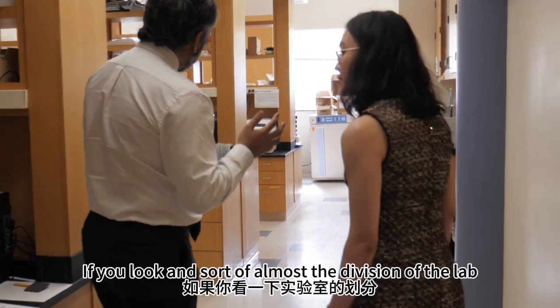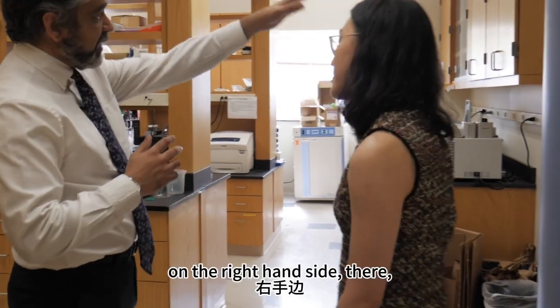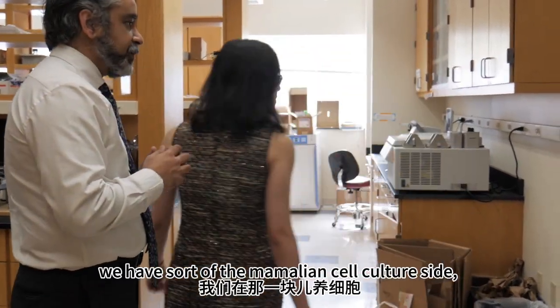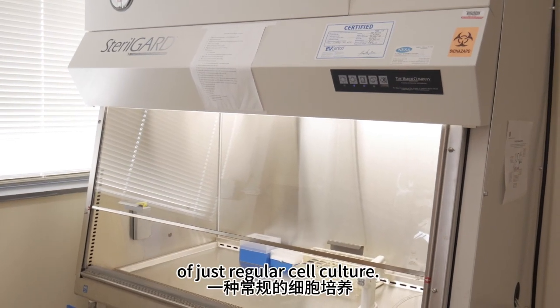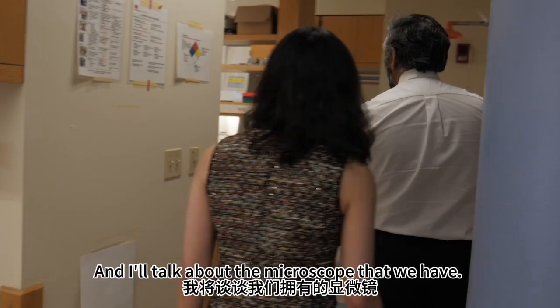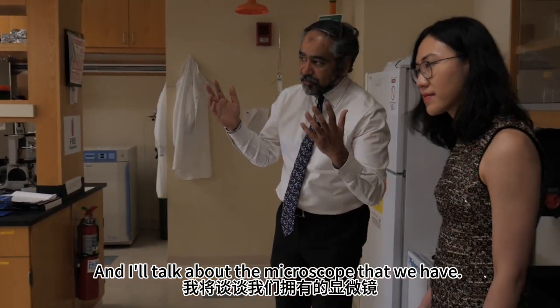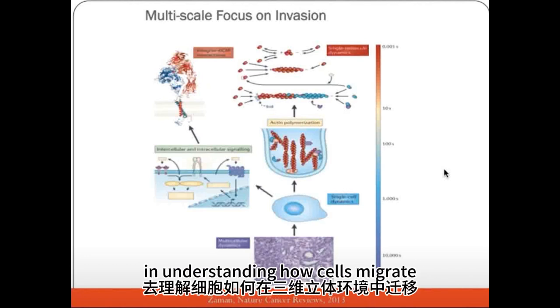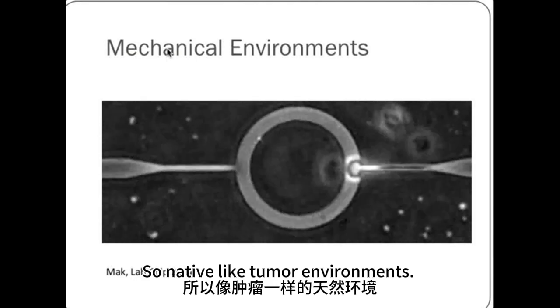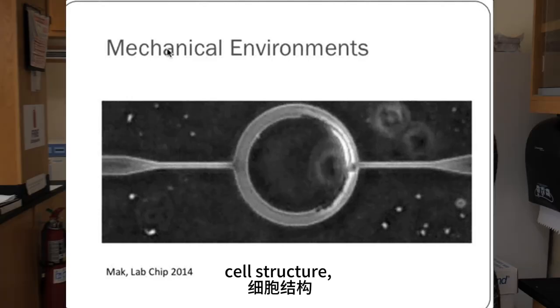So if you look at almost the division of the lab, on the right-hand side there we have the mammalian cell culture side, which is basically just regular cell culture, and I'll talk about the microscope that we have. We've done a lot of work in understanding how cells migrate in three-dimensional environments, so native-like tumor environments in terms of their mechanics, interactions, cell structure, cell function.